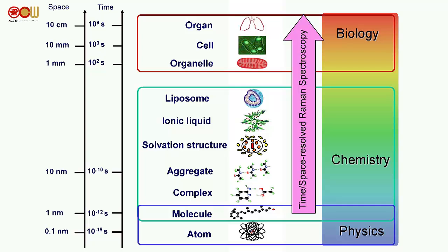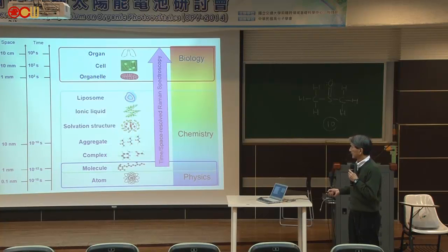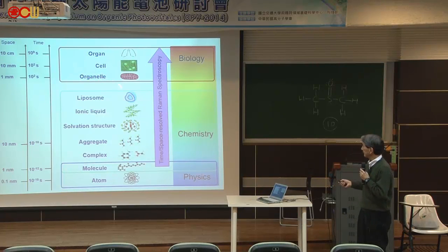I can tell you that I came up this ladder starting from the molecule in the very ultrafast regime, the very small world, to the real world of biology, organelles and cells, by using time and space-resolved Raman spectroscopy. I talked about time-resolved Raman spectroscopy here, but if you go to a larger scale, it is also very important to space-resolve the information.